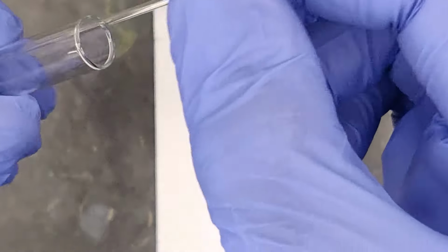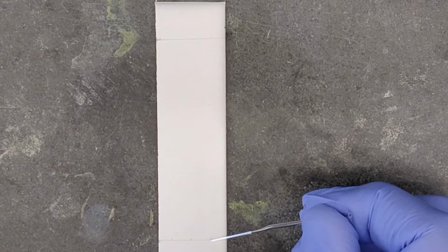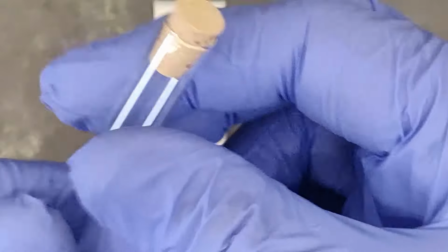Next, a solution of the reaction product mixture in dichloromethane is taken up into a new, clean, and unused TLC spotter and then spotted at both the far right lane and at the center lane directly on top of the 3-hexanol standard that was also spotted there. Remember to recork the test tube containing the reaction product mixture and place the tube upright in a secure location. The plate is now ready to be placed in a TLC chamber.